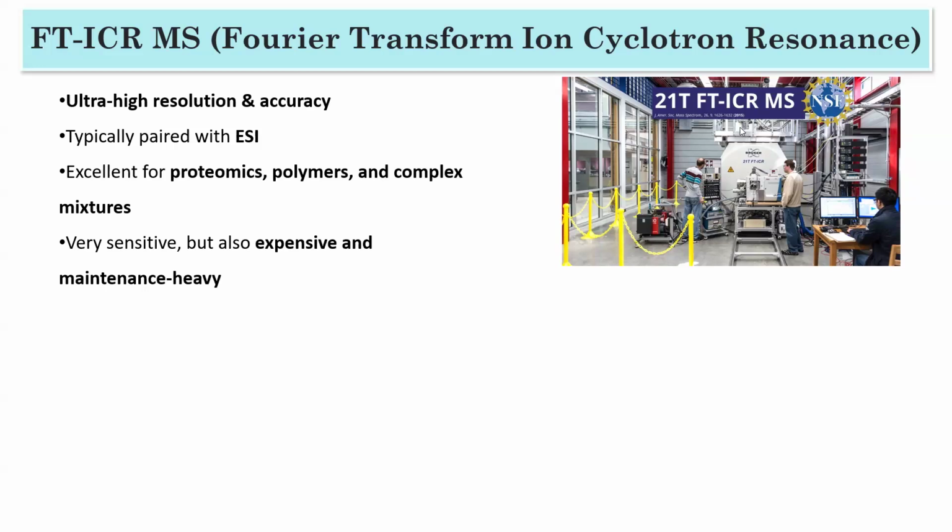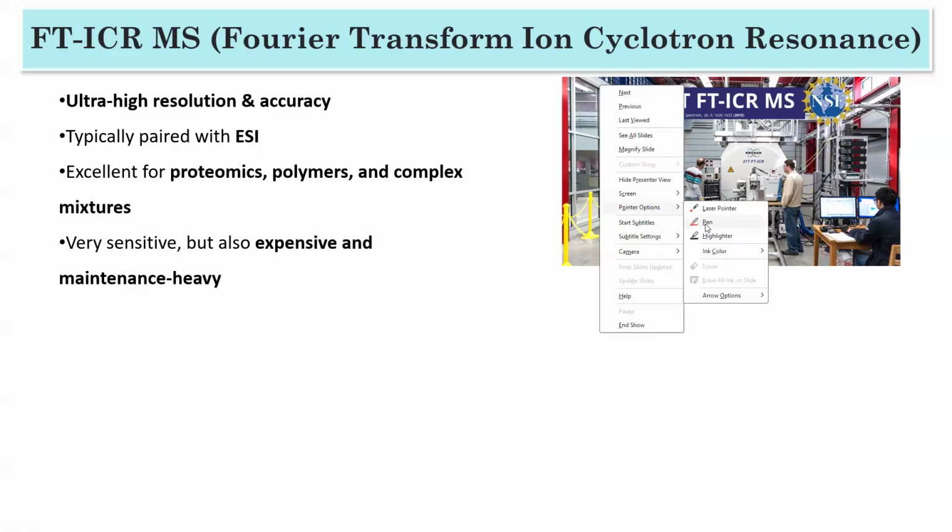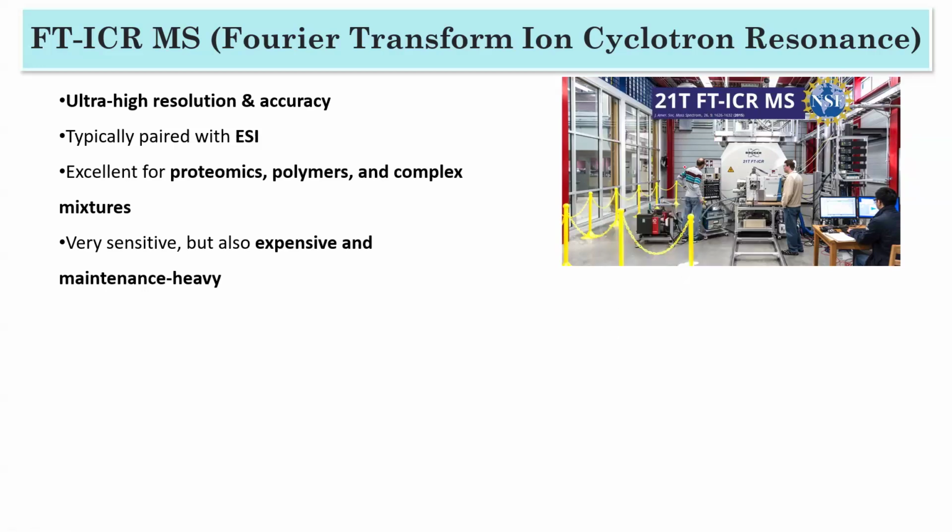But you see FTICR, it is so big. So why is it so big? The best reason is that in FTICR we are using a very high magnetic field.